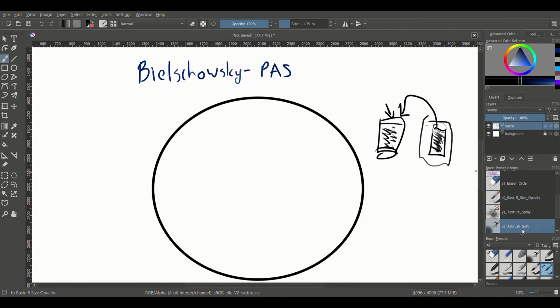So at that point, we're going to see things going to be kind of gray all over. And you're going to see your fibers and your entanglements start showing up. And then you're going to put that in ammonia water again, and then use sodium thiosulfate to get rid of any particulates kind of floating around in there.